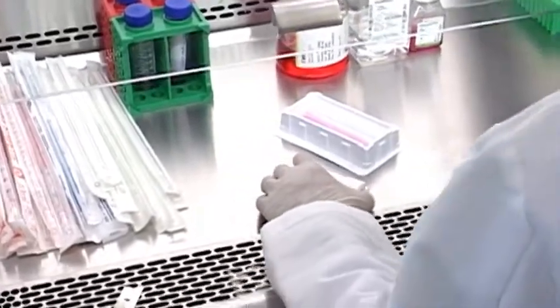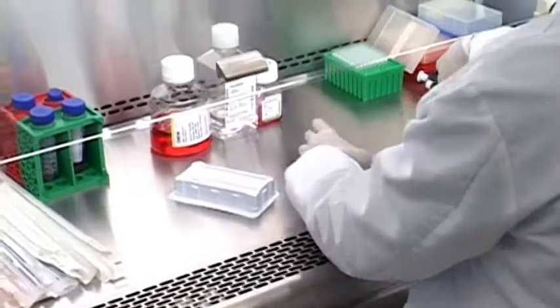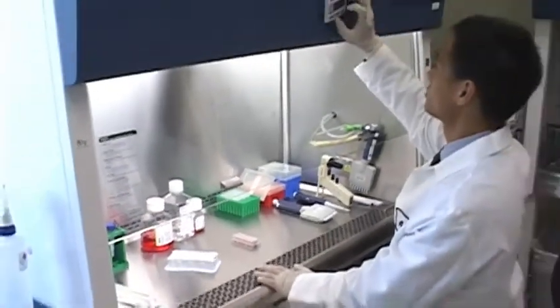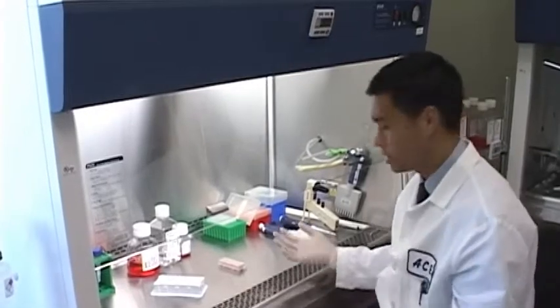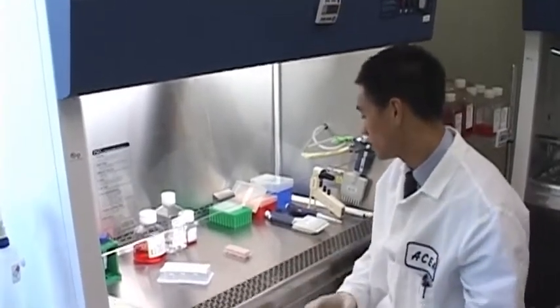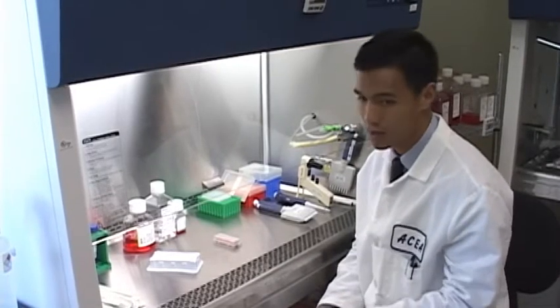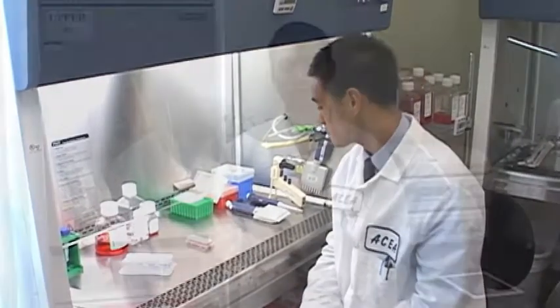And that's it. And so from here, we'll leave this plate at room temperature underneath the tissue culture hood for 30 minutes. This is just to ensure homogeneous cell seeding at the bottom of the plate. And after that 30 minutes incubation, we'll put it back onto the station and we'll monitor it overnight for growth. And after overnight incubation, we'll add our compounds.